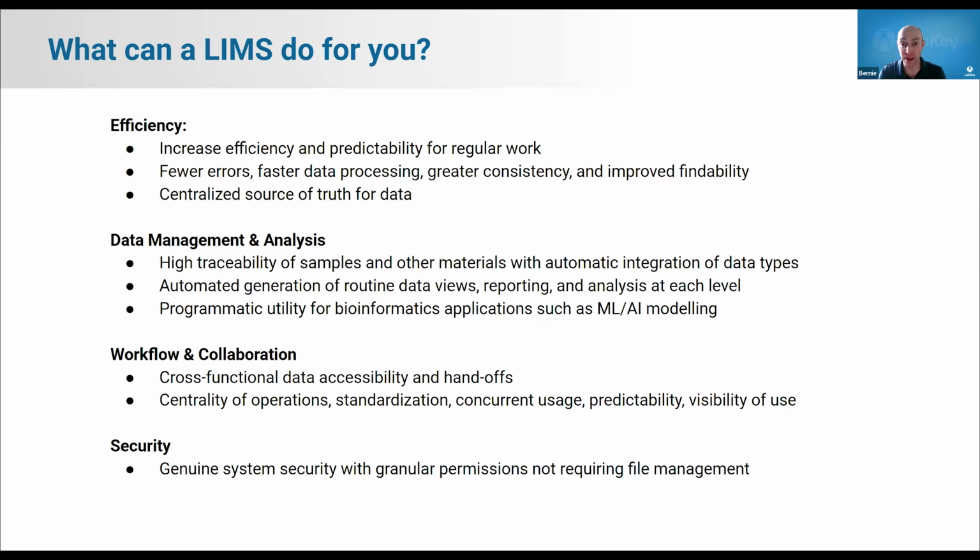It's also a big deal for everyone to know the single centralized source of truth for data, because the amount of time that I have heard people spend digging data and files out of various systems and places for themselves and for each other can be pretty appalling, impressive. The purpose of a LIMS, though, is really for data management.